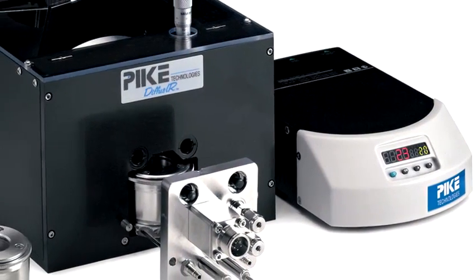In this video application note, I'd like to discuss how and why we use the Pike diffuse IR chamber for the thermal treatment of heterogeneous catalysts.